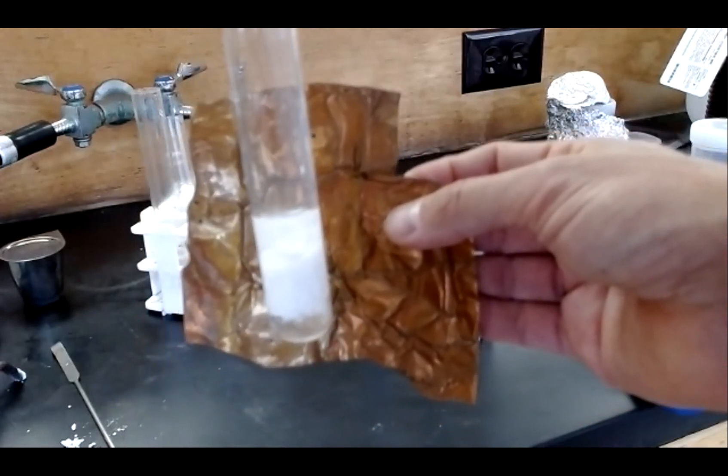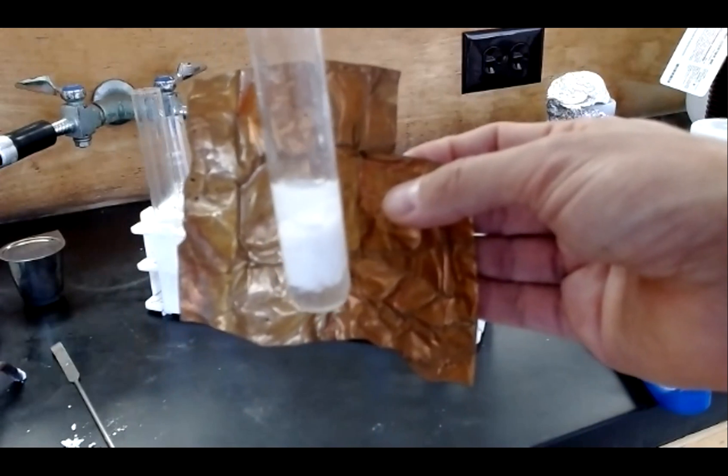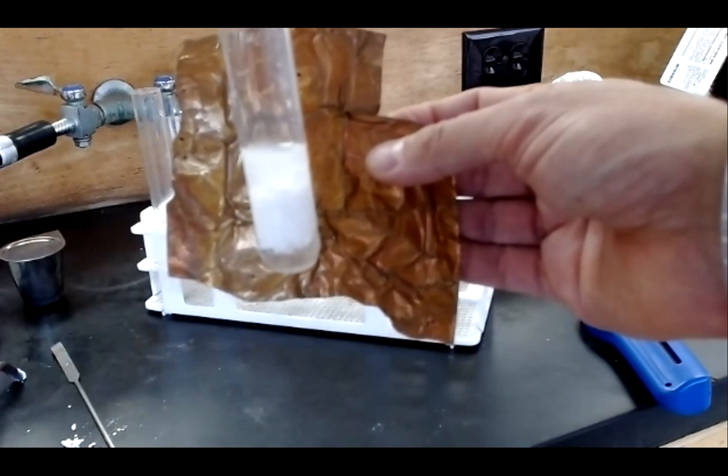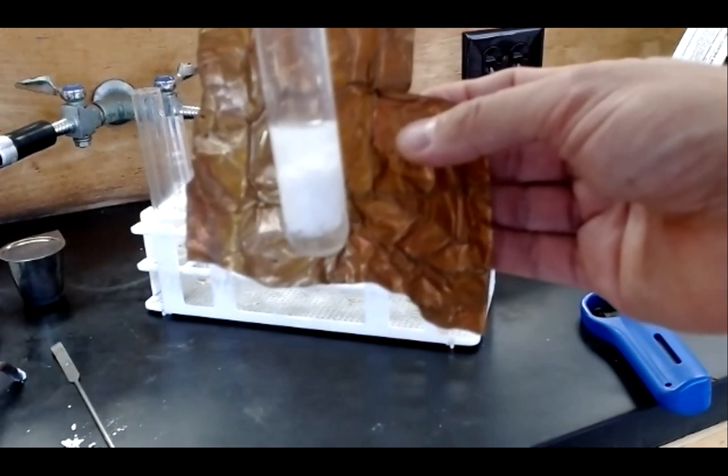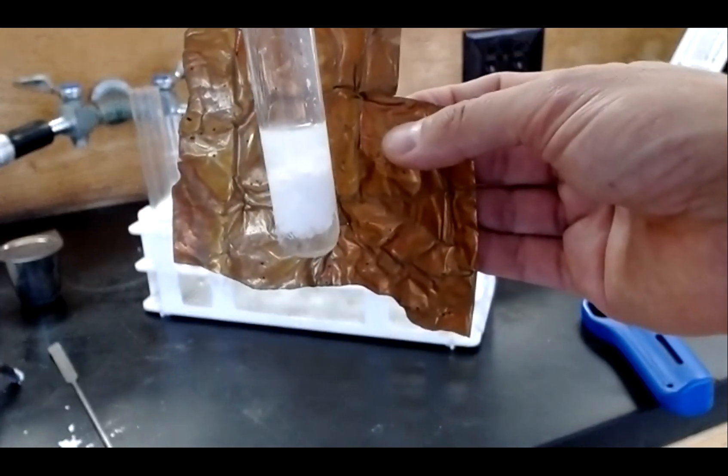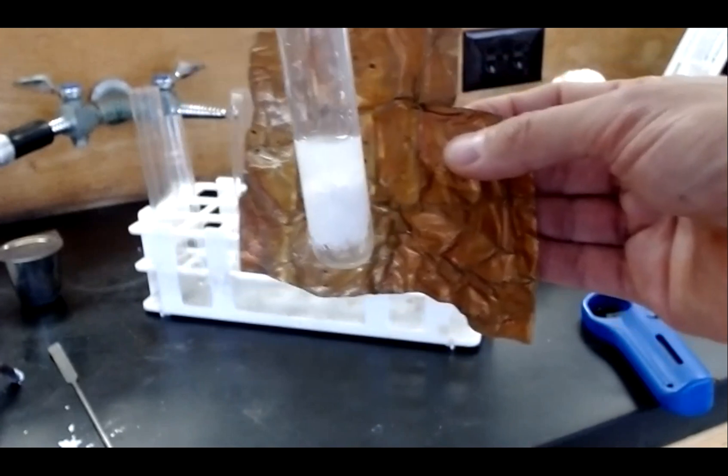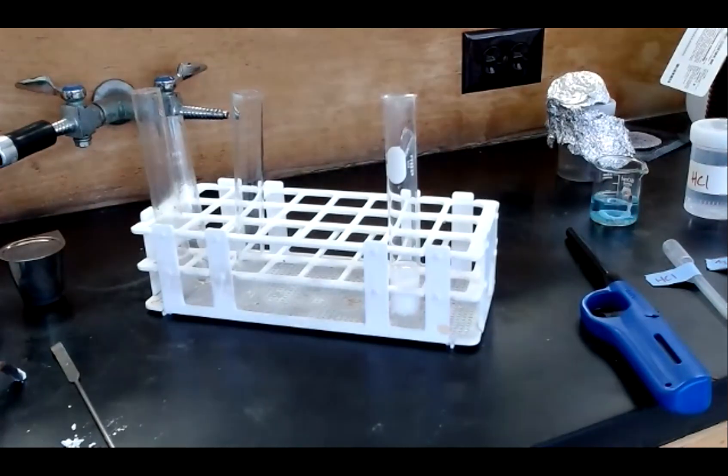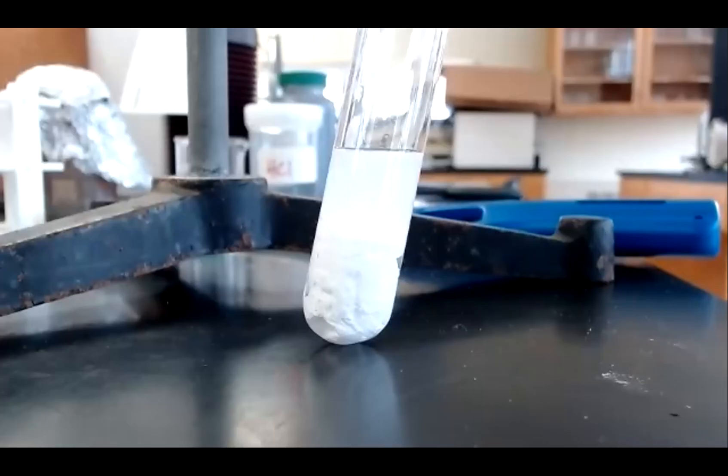This is a really good example of a double replacement reaction. There's very clear evidence of a chemical reaction as the precipitate forms, which is one of our pieces of evidence. And we'll look at the equation which will give us a clue as to what that precipitate might be. With the up close shot, you can see the very clear solid precipitate that's formed inside of that test tube.